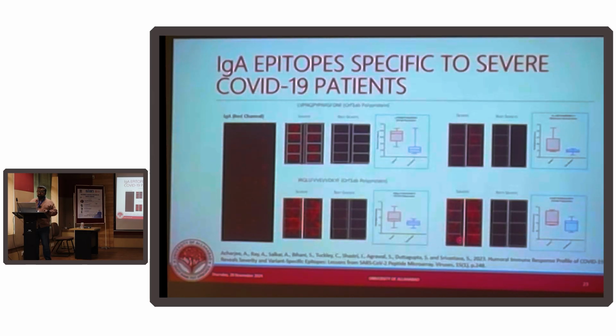All these tools that we are discussing with you, Reactome, MetaboAnalyst, they have their own individual research papers. These are developed by research groups. You can go back to those papers and read them. Most of these tools would also have their own tutorials that you can spend 4 to 5 days on. There are MaxQuant summer schools that run for almost 5 days. Of course, whatever they will teach in 5 days, we could hardly cover in 1 hour. So the idea is to give you a flavor. Things exist. You know MaxQuant exists. It's free. You can use it on your laptop.